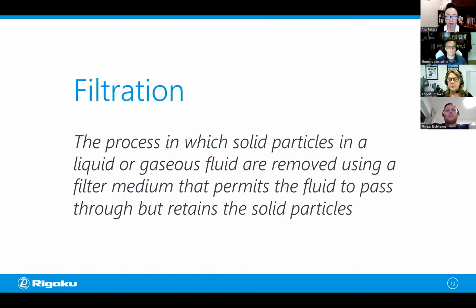And the basic requirements for that process is, first, you have to have a filter medium optimized for the size of those particles. Second, you need some sort of fluid with suspended contaminants that you want to capture. And those contaminants may be the things you want or the ones you're going to get rid of. You also have to have a mechanical device, the filter holder, that's going to hold this filter medium in place as fluid flows across. And then lastly, you have to have a driving force to cause that fluid to flow. And sometimes that's just gravity. And in other cases, you may need to apply some pressure to cause the fluid to flow.